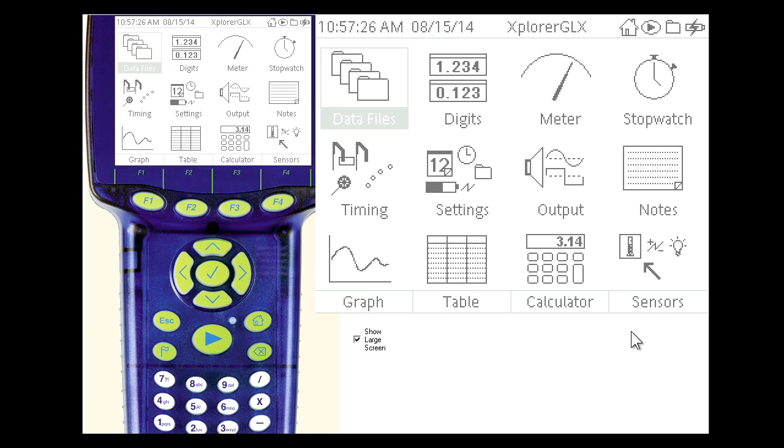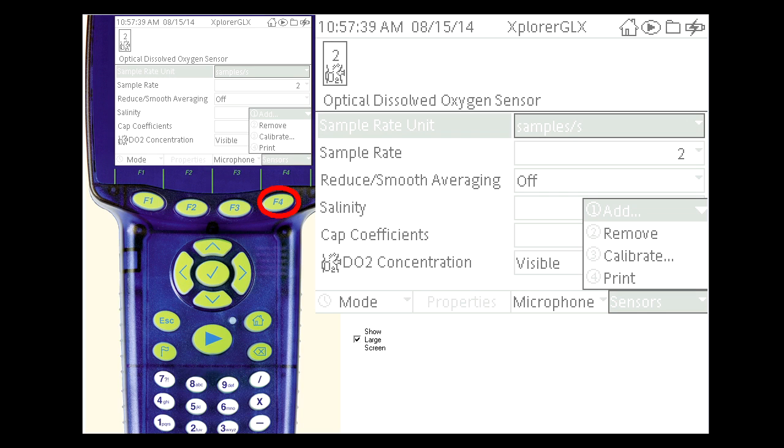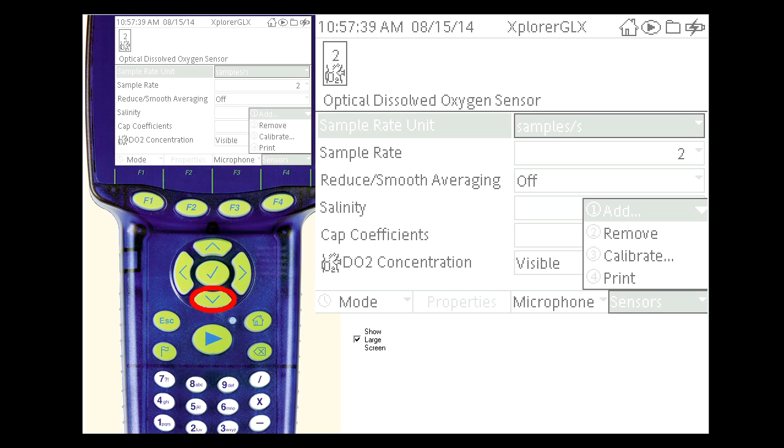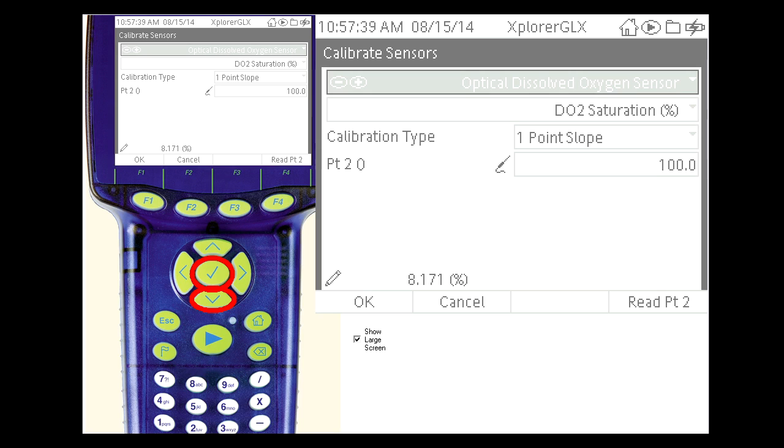To use the Optical Dissolved Oxygen Sensor with the GLX, enter the Sensors menu. Here the salinity and cap coefficients can be set. To calibrate the sensor, again select from the Sensors menu. Then Calibrate. This will be a one point slope calibration and in this case the Optical Dissolved Oxygen Sensor is already selected.